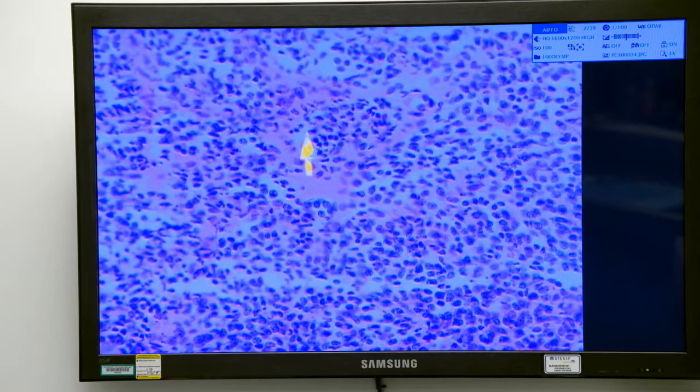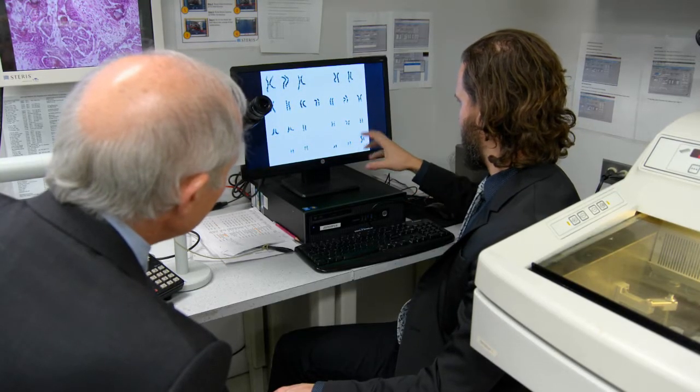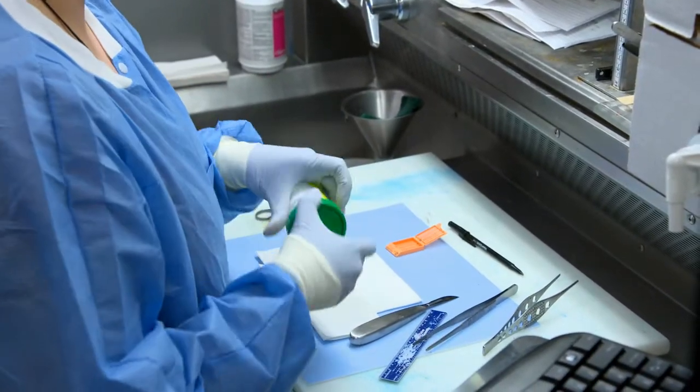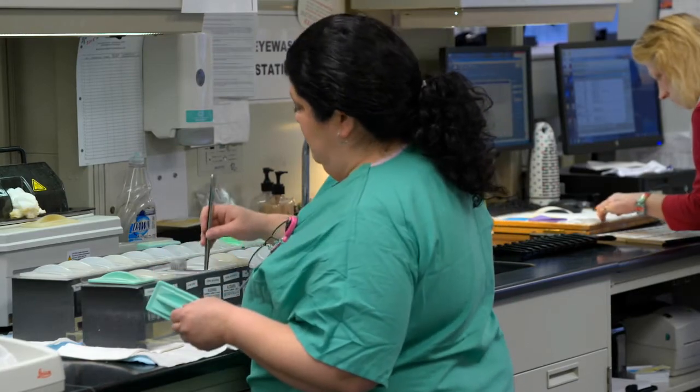Pathologists are physicians who are trained in interpreting laboratory data, whether it's clinical data from blood samples and also for making diagnoses from tissue specimens and interpreting results from genetic testing. The most common tissue pathology tests are usually biopsies. It's usually put in some liquid like formalin, which preserves the tissue.